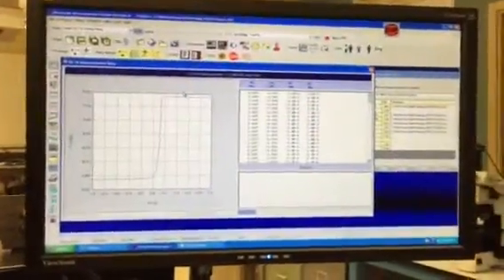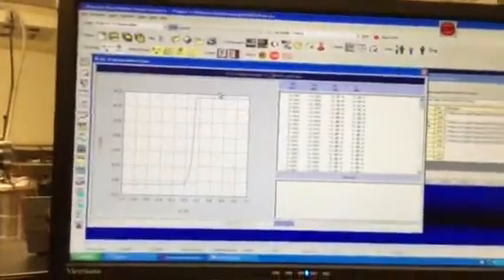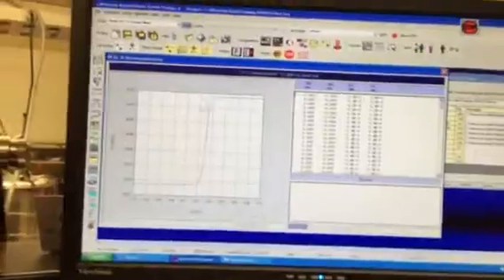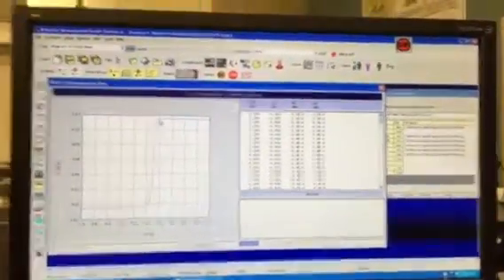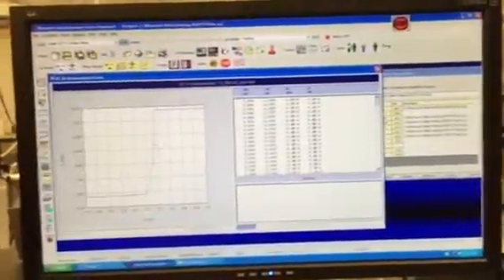What the instrument is good at doing is moving that window of the A to D to make these measurements. In this case I said, no, don't move it, fix it. So I got this portion, but I can't get anything above that. This fixed is going to be the fastest because there's no seeking of the proper range. Auto says, let me get some points and see where I have to be to make these measurements. So, okay?